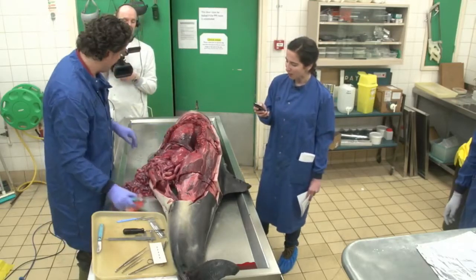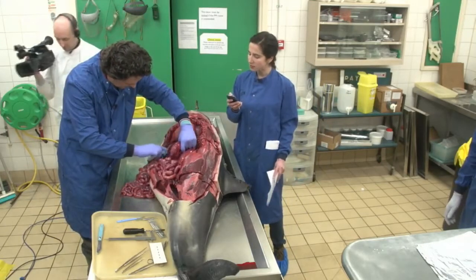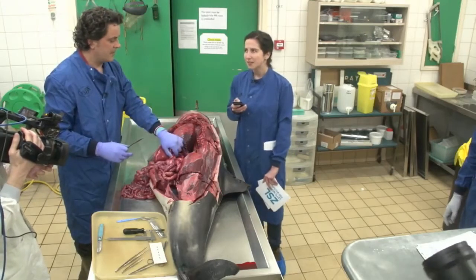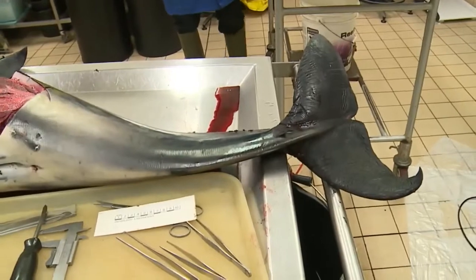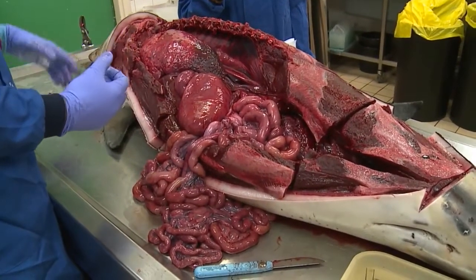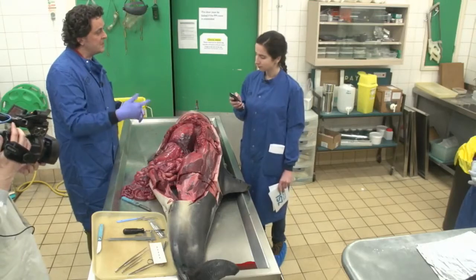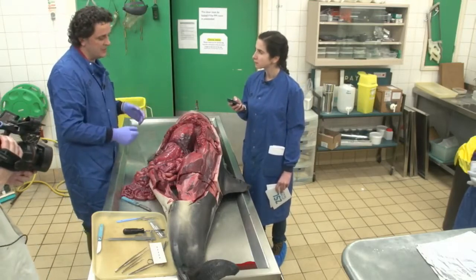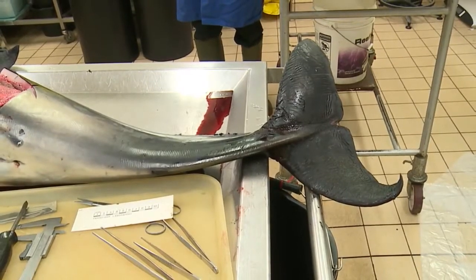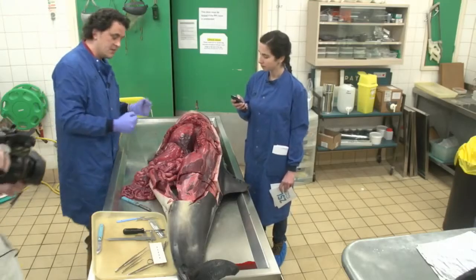We've had some other questions in, including one from Sarah, again on email. Thank you very much, Sarah. She asks, what are the main injuries that you see suffered by dolphins? What injuries do you see when they get caught in nets in particular? I guess that's what we're seeing tonight. You can see these net marks around the body, and we can see this evidence of hemorrhage in the roof of the back. Very occasionally, in a small number of cases, we've seen some fractures around the skull, perhaps around the ribs. We think what's happening there is as they're brought in over the gear, they may have just been bycaught and have just died, and then they get these fractures around the body too. But generally speaking, we would see, in most but not all cases, these net marks, sometimes penetrating marks to the body wall when they're lifted out of nets. Again, I've got to stress, they're dead at this point. They're hoiked out of the gear and over the side. So we see that sometimes as well.